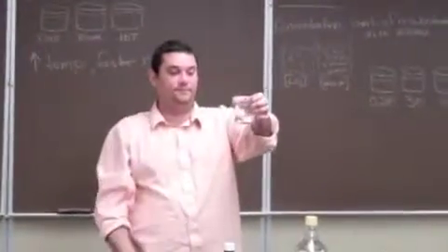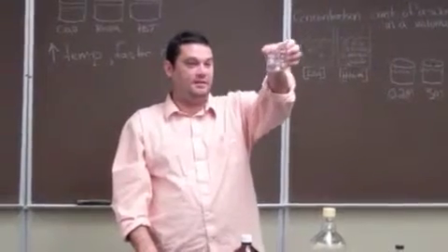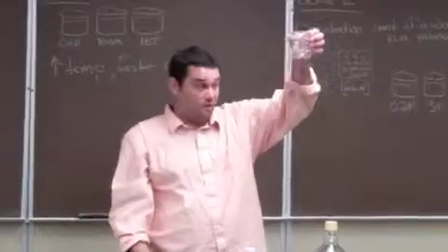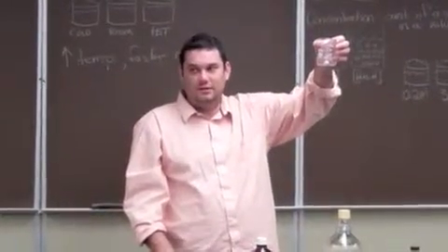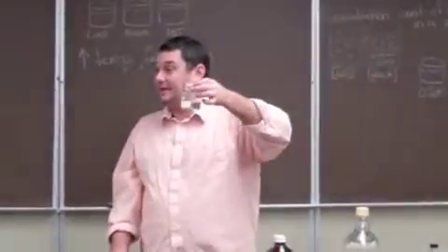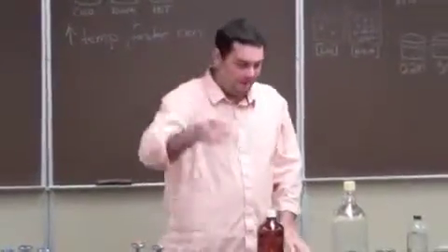Ready, go. Isn't that boring? Do you have any evidence of a chemical reaction? There are some bubbles. That means there's gas. Do we start with gas? No, at least most people didn't. But we're getting gas. That means it's not a physical change. It's a chemical change.